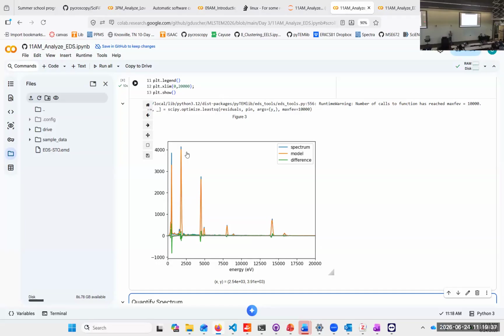And then you subtract a linear interpolation between that, because you know your background is rather benign, and you just sum the counts where this peak should be. For overlapping peaks, you're out of luck, right? So it doesn't work. While this method does still work.